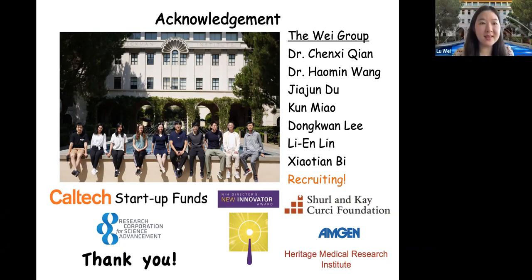Right, so to be quantitative, the easiest way is to just add them together. Because when we label them in a deuterated way, we're basically replacing the hydrogen components with deuterium, so that all the newly synthesized or transformed molecules are tagged by carbon-deuterium. Then because carbon-deuterium has almost the same cross section as carbon-hydrogen, it's basically new plus pre-existing. Adding them together will give us quantification. For the alkyne probe, that will need a little bit of calculation for how to transform the alkyne cross sections to the CH cross section for the pre-existing molecules.